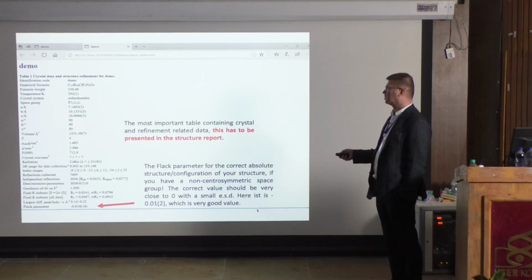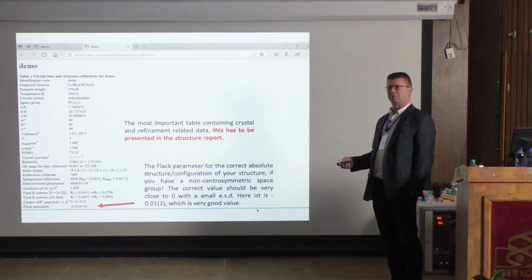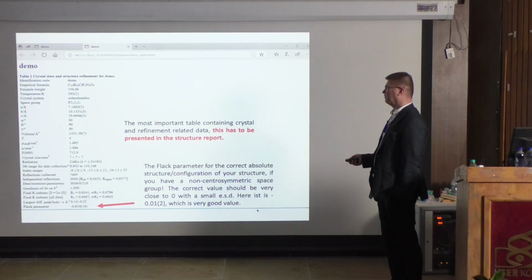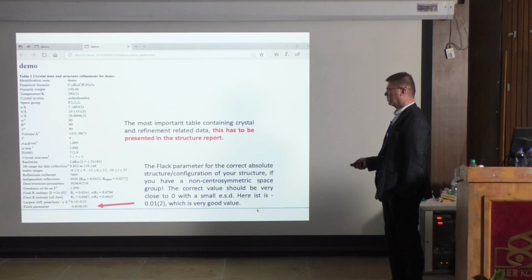And then in here it's 20, so here it's 24, 25. So you can see always we aim that these HKL ranges are bigger than their unit cell axis. So it means that then we have a higher resolution. If they would be the same, then it would be 1 angstrom of resolution. In some cases it would be okay. But typically we aim for this.